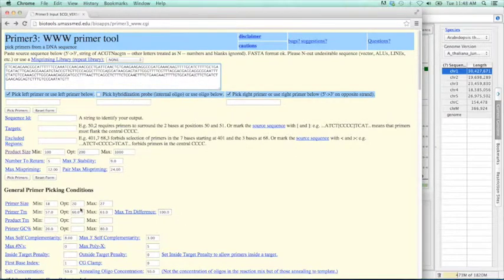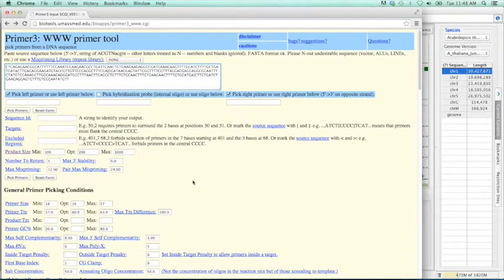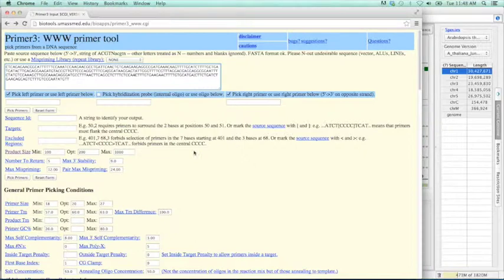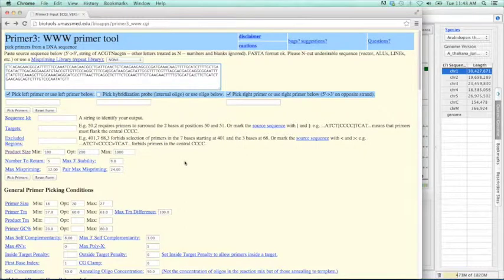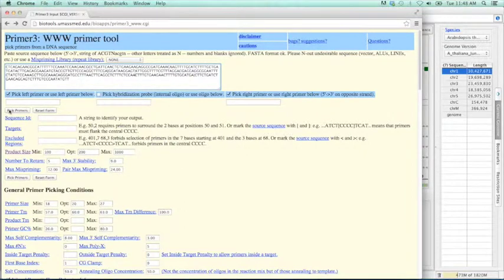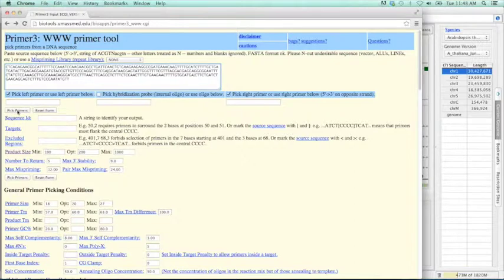Now, as you can see, Primer3 has many, many options. We're not going to change any of the default options for today. But if you need to, there are things like Primer Size, Primer Melting Temperature, GC Percent. So there are many options. In order to get our primers, I will click on Pick Primers. And as you can see, Primer3 has very quickly found us two primers.